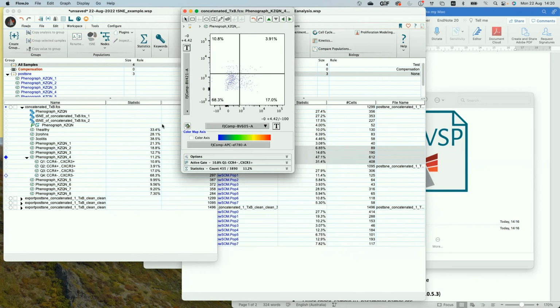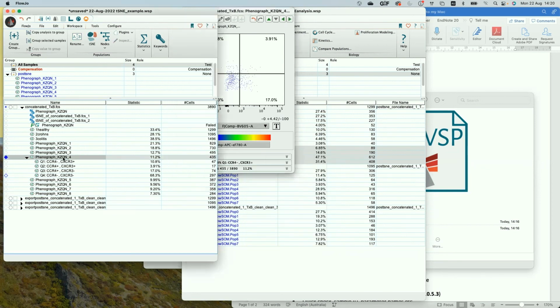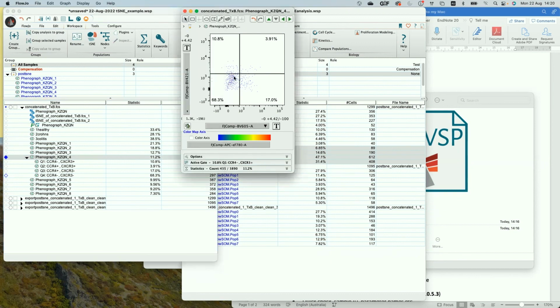And by doing this on the clustered group, you can use it kind of like a purity check, in that if I set the gate here, I'm getting 70–80% of that clustered population. And then you can think, all right, well, that seems to be a biologically interesting population.